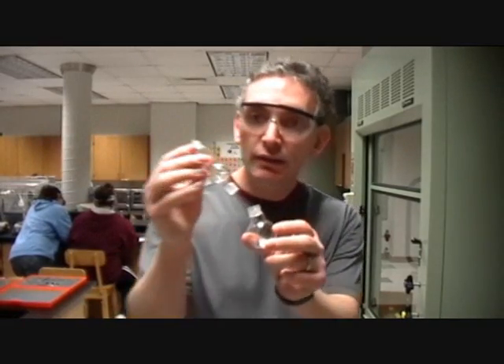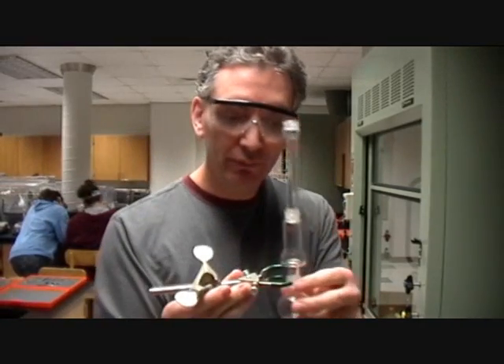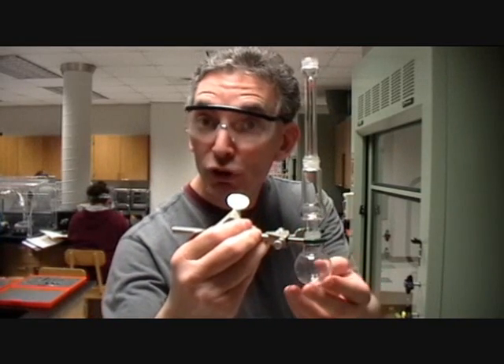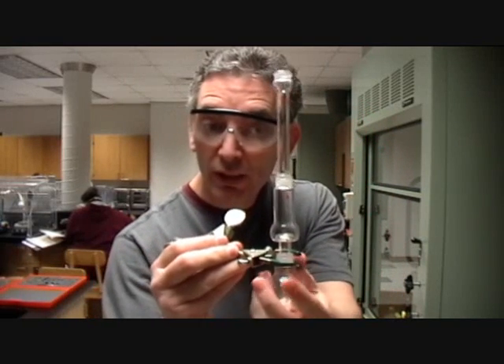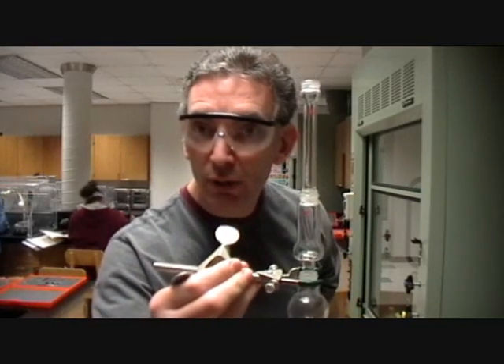We will have our Claisen head on top, and then a simple air condenser which fits onto the top. We need to clamp this to your hot plate using one of the clamps. Make sure you clamp it by the bottom flask — clamp it at the bottom so nothing is going to fall off. If we clamp it higher up, the flask could fall off the bottom. Clamping at the bottom means gravity won't allow anything else to fall off.